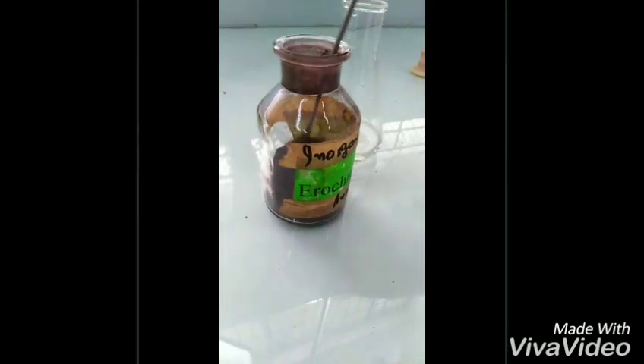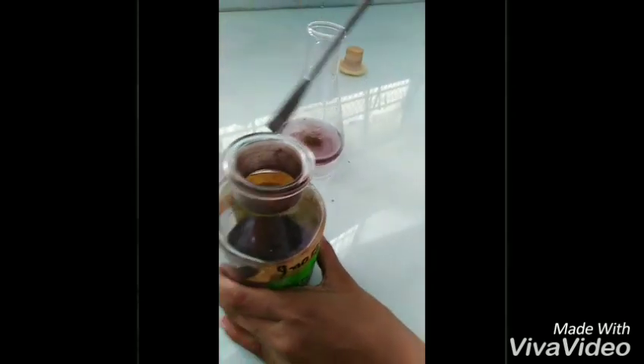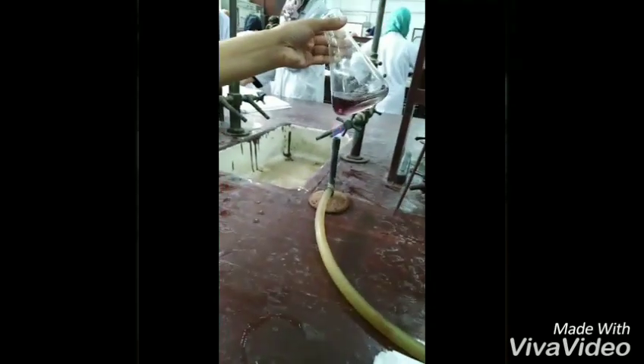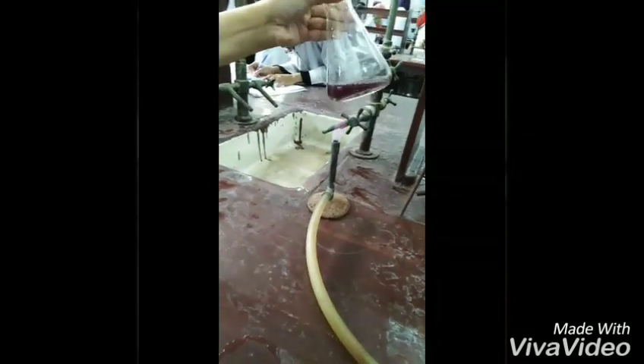We have added the buffer of pH 10 because EBT (Eriochrome Black T) indicator works best at pH 10. We will swirl the solution and titrate it against EDTA solution.